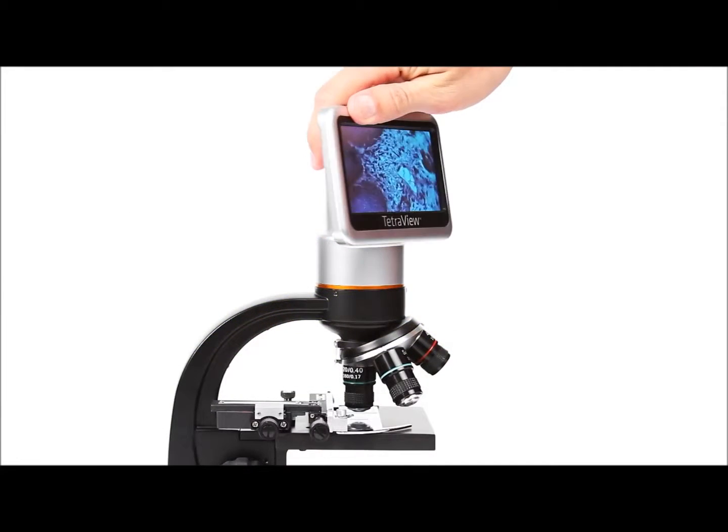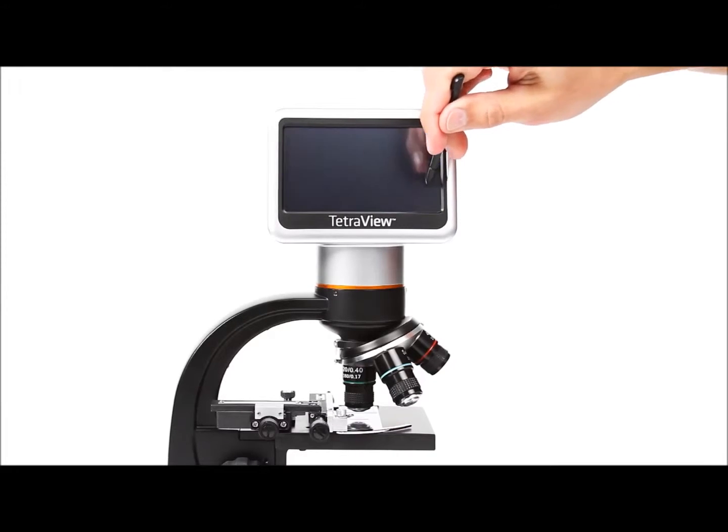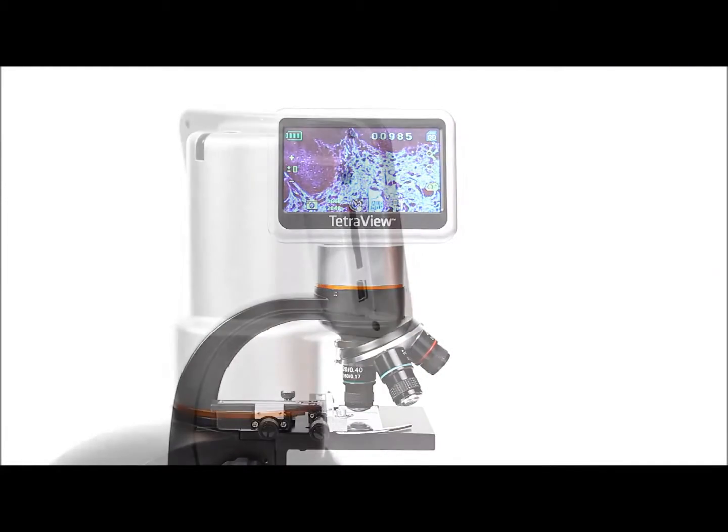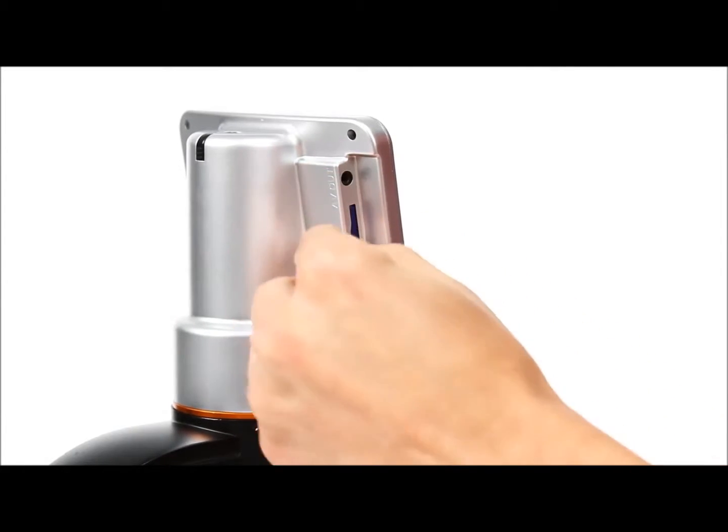The 4.3-inch touchscreen rotates 180 degrees to share the view with others. Capture images and video with the built-in 5-megapixel sensor and save them to the included 2GB SD memory card.